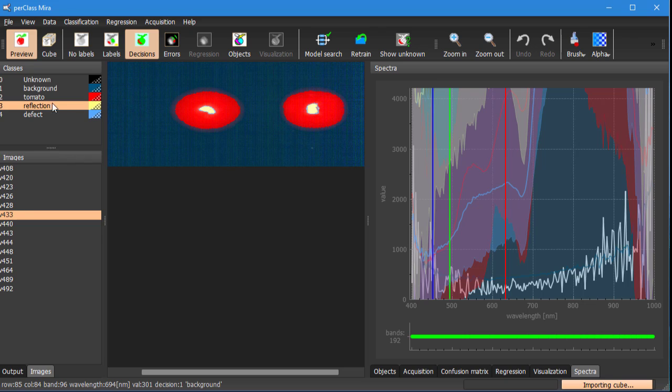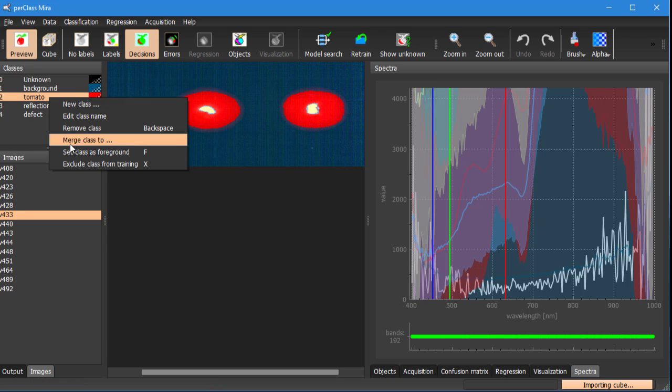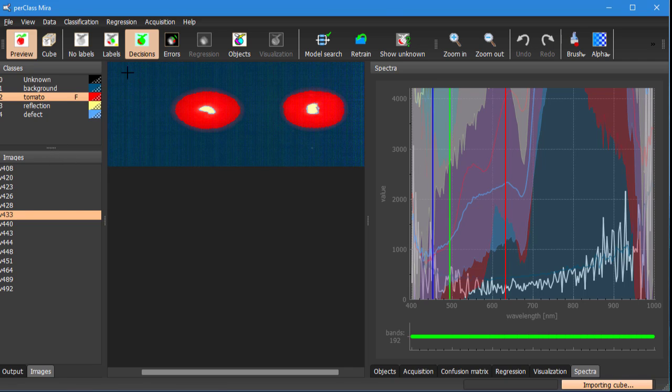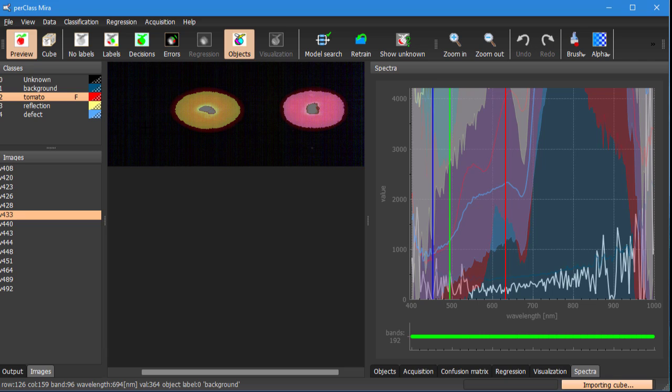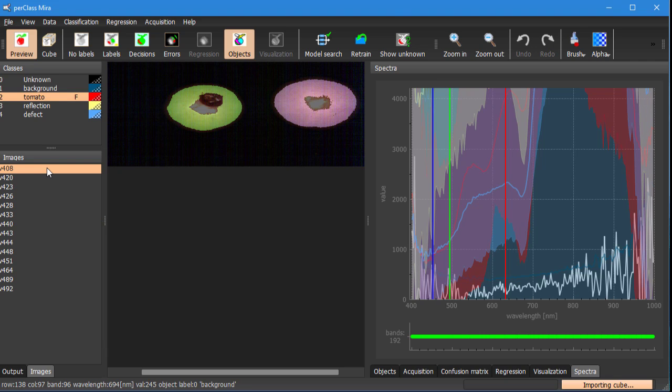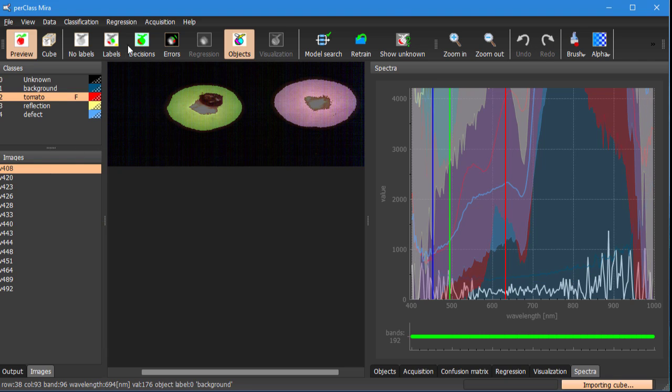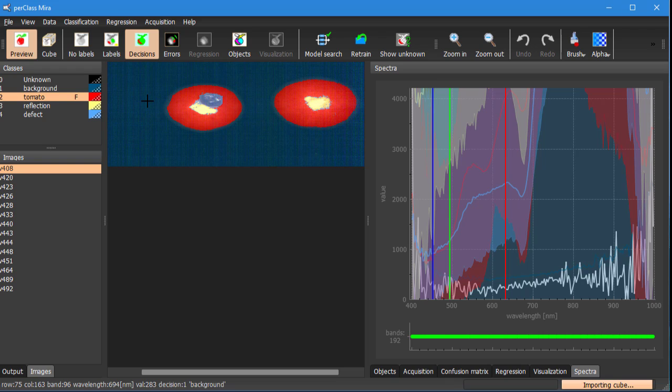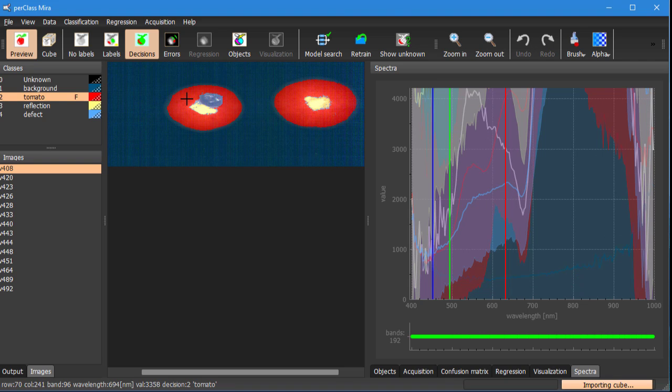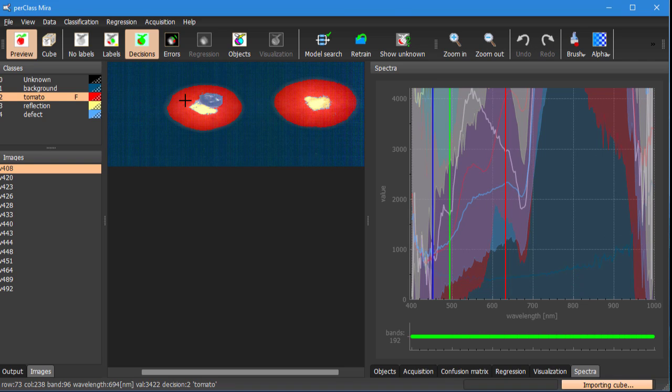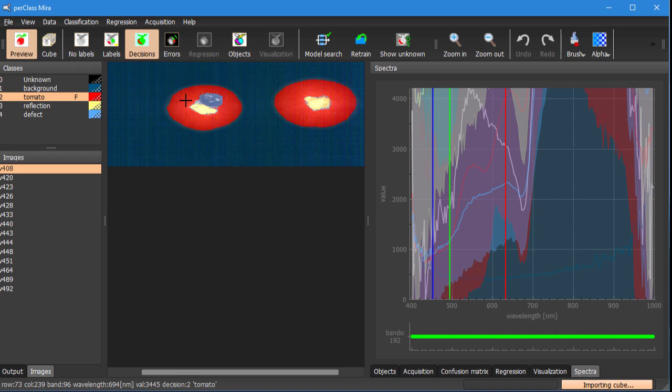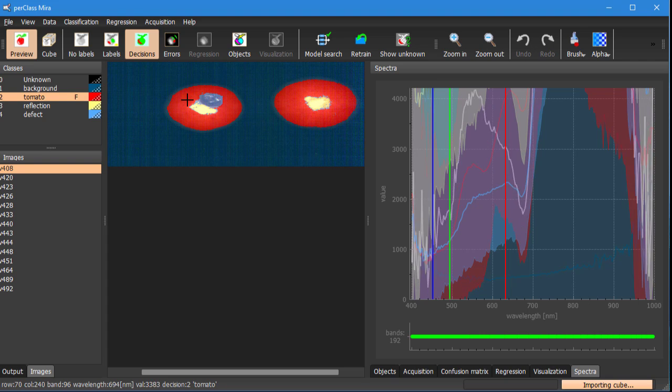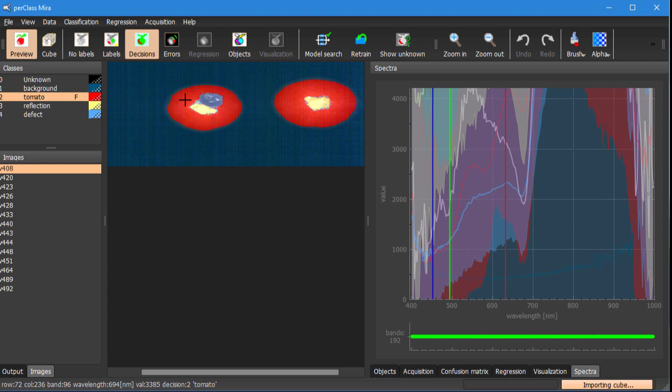For that we need objects so we will highlight the class of tomato as we will flag it as foreground and therefore we can segment out individual objects. If we want to do regression modeling we need to attach numerical values in this case bricks values to the individual tomato pieces. We could do that manually as discussed in a different tutorial but here we want to import automatically the numerical annotation from excel file.